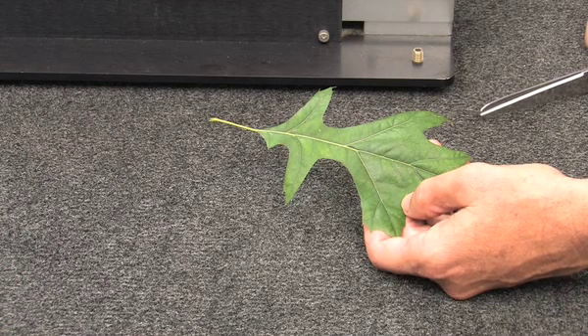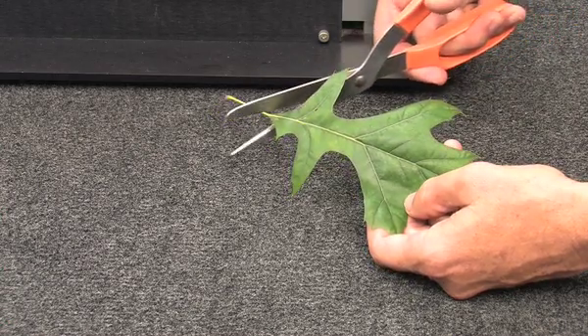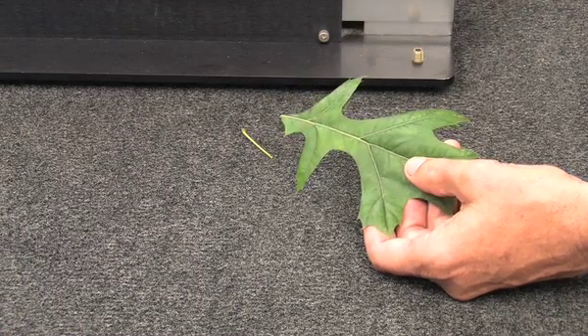For our lab exercises, we are primarily interested in the area of the leaf blade and later in calculating the mass per unit leaf area. Inclusion of the petiole tends to bias those measurements, so we will remove the petiole by cutting it off at the base of the leaf blade.